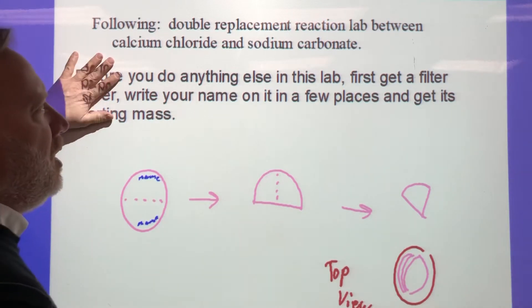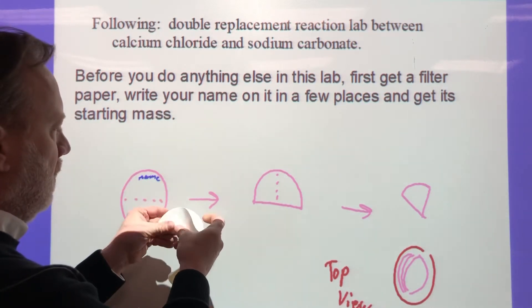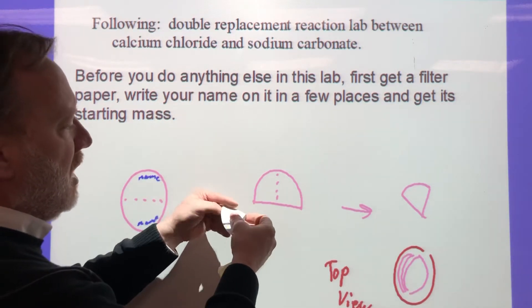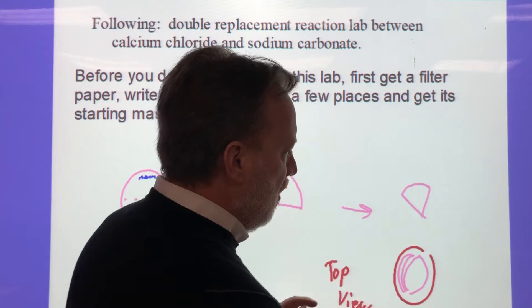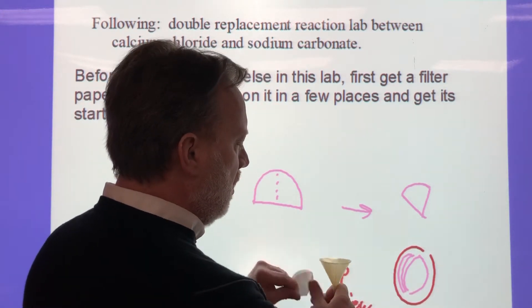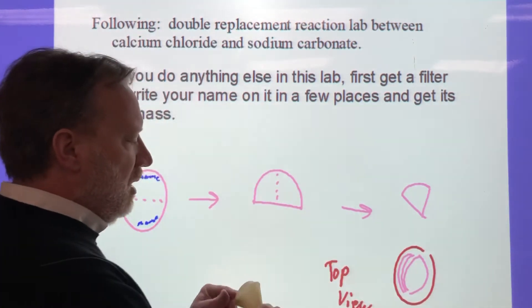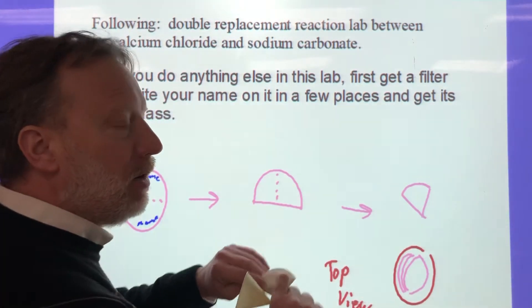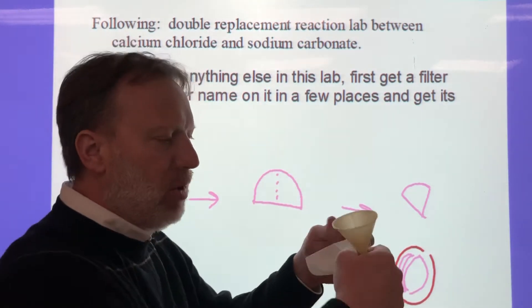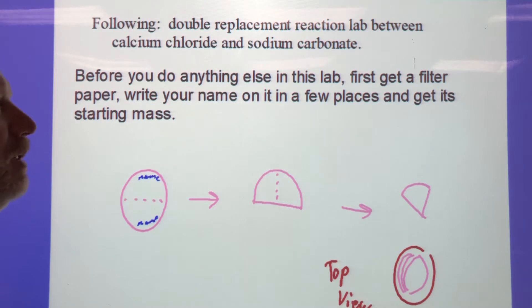Before you do anything else, get a filter paper and write your name on it in a few places. Fold this filter paper in half, then in half again, and put it in a funnel with three pieces on one side and one on the other — not two and two. Leave a hole so your solution runs through. Put your name in three different places so you can read it when we're done, because we have to weigh that filter paper at the start and at the end.